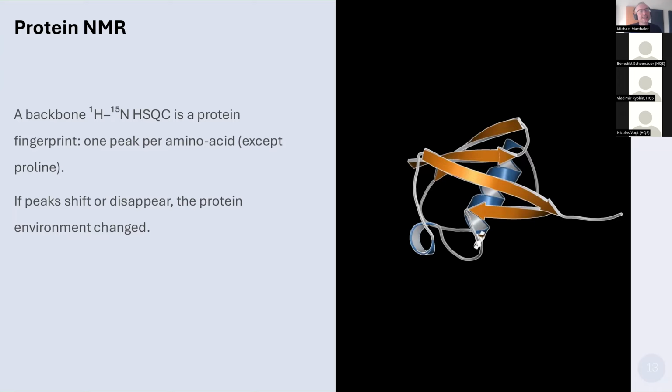This is typical because taking just a 1H spectrum for a protein is not so informative. You can imagine it to be very crowded. In fact, what I showed you at the very beginning of this webinar was this very crowded 1H spectrum for the same molecule.